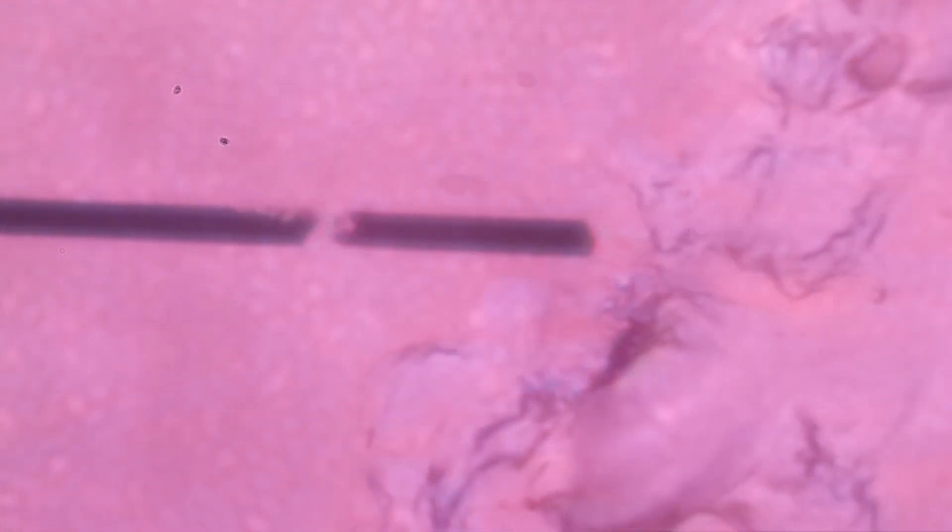There's a 75 times monocular at the slide and then a 300 times digital that I duct taped to where the eyepiece was. That black line you see right there, that scale - the distance between the middle of each line is 10 microns. Those little red dots are probably the nucleus of cells.